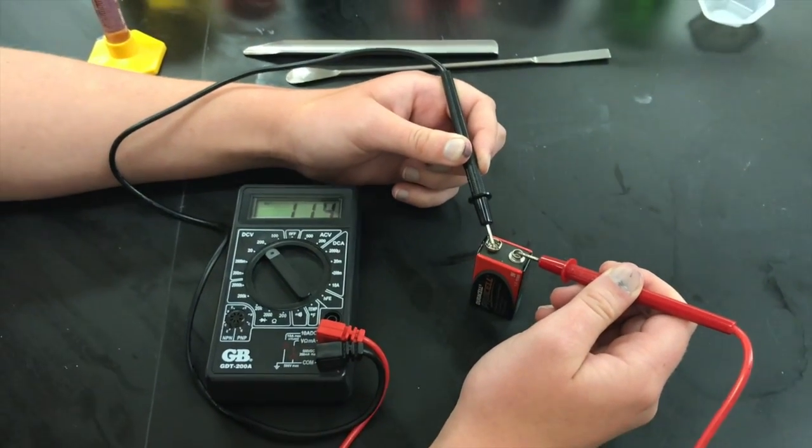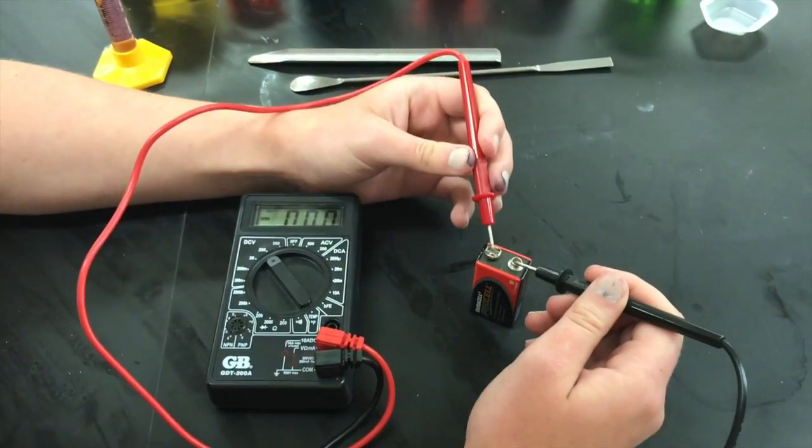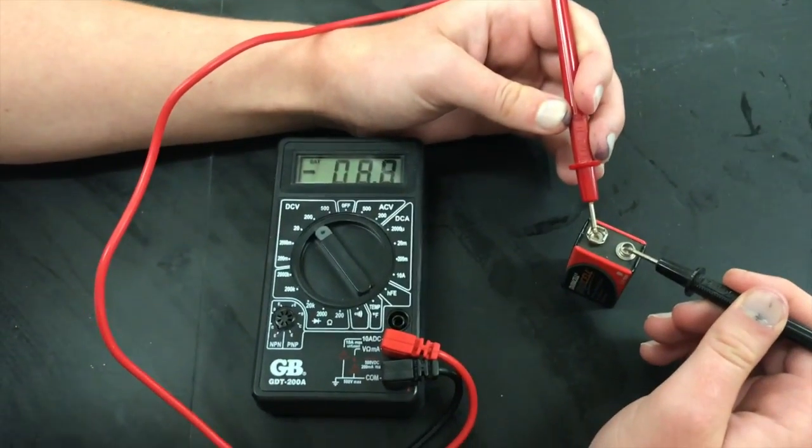We use it by completing the circuit by making contact between the electrodes and the voltmeter probes. Voltmeters in today's market cost around $10.